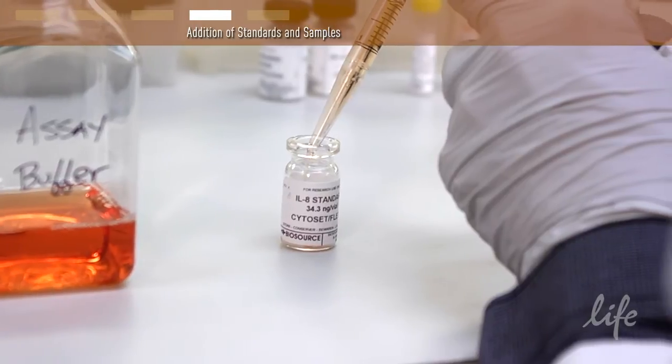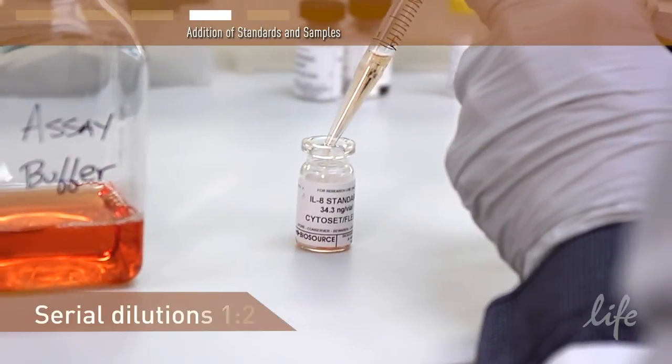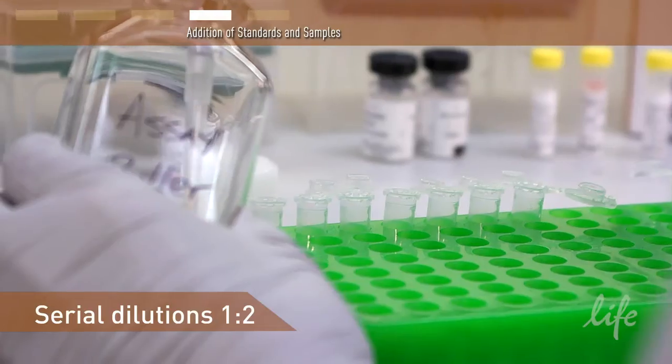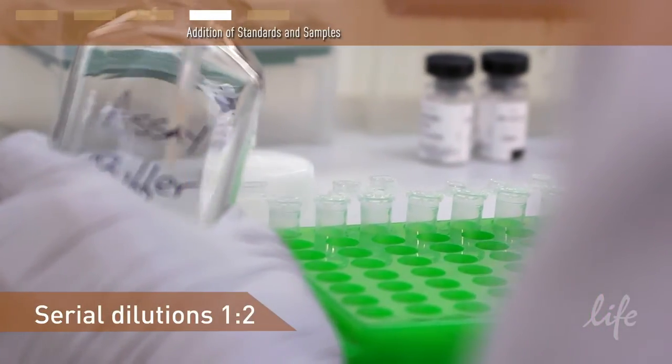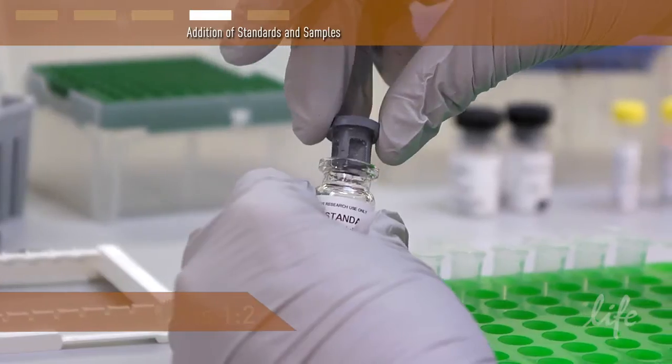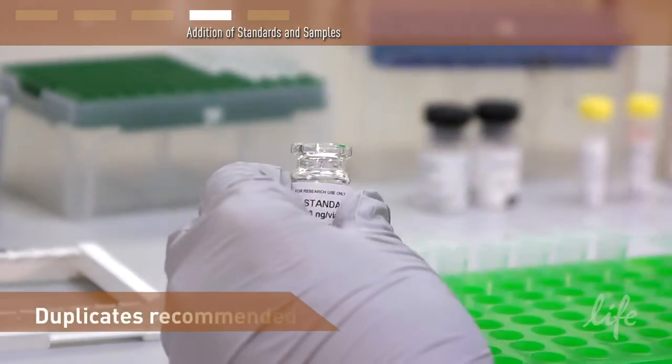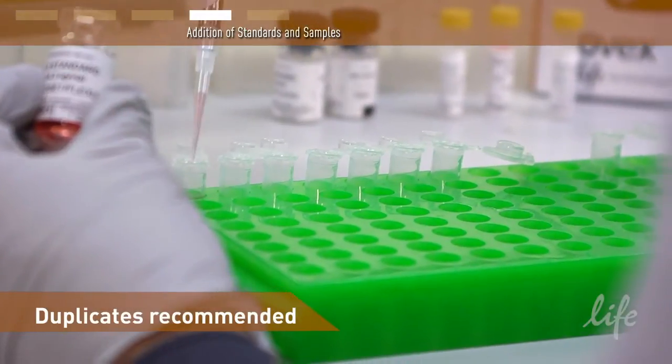Prepare a 7-point standard curve by serial dilution according to the technical data sheet. The low standard or zero standard will be the reconstitution buffer alone. Prepare sufficient volume to run each standard in duplicate at 100 microliters per well.